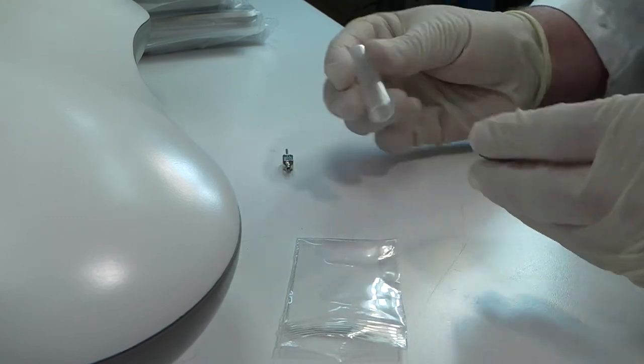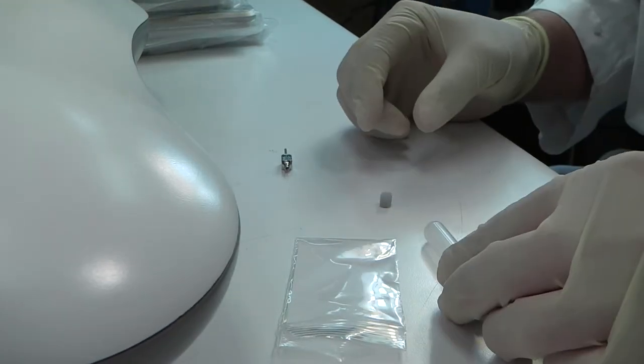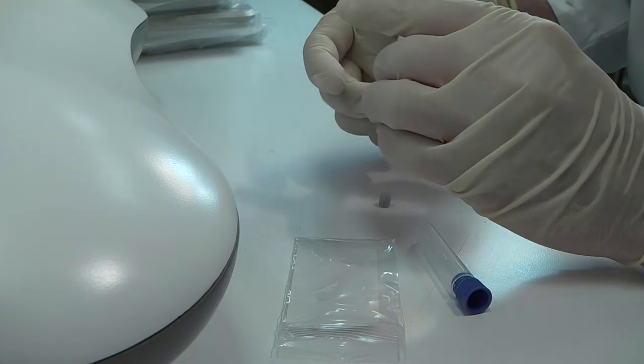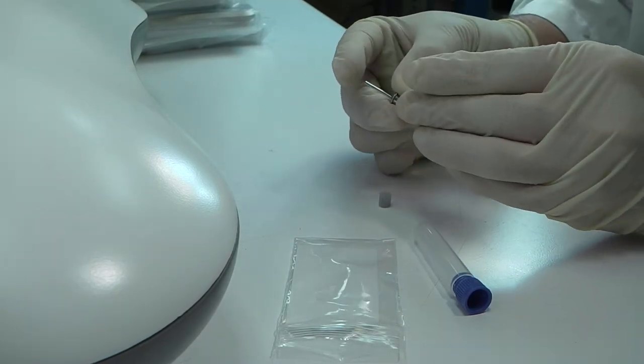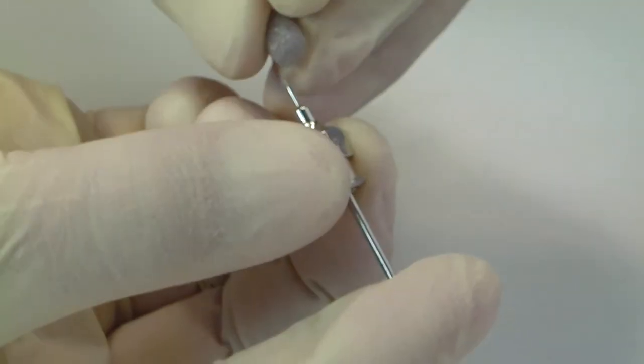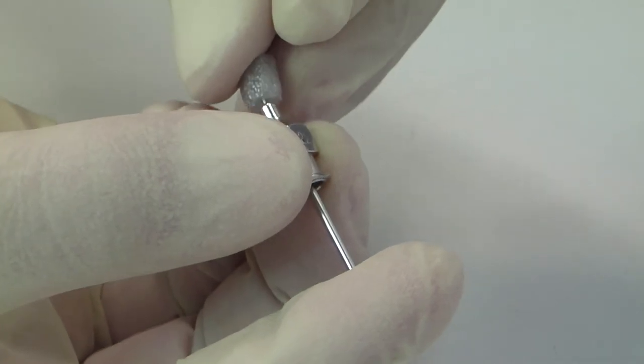To repackage and store a probe assembly, carefully put the protective foam piece back onto the tip of the probe assembly to prevent blunting the tip of the test probe. Be sure to support the back of the test probe without bending it so that the tip of the test probe pierces the foam piece.